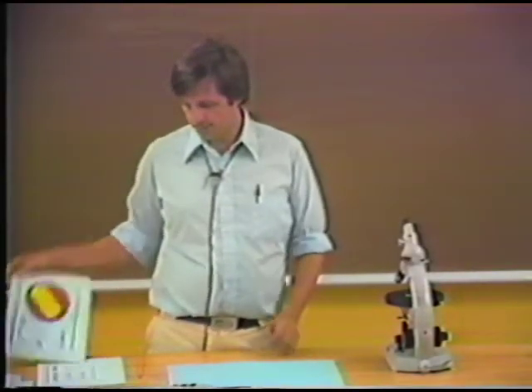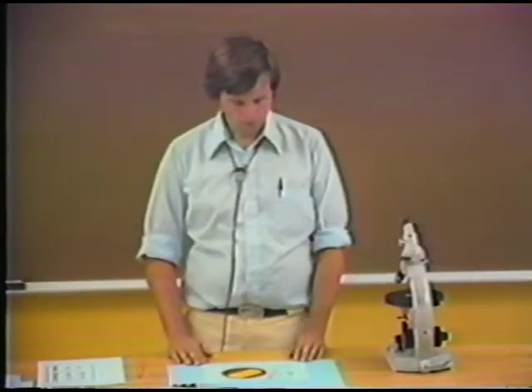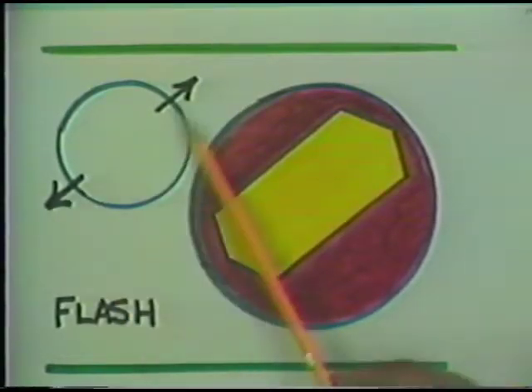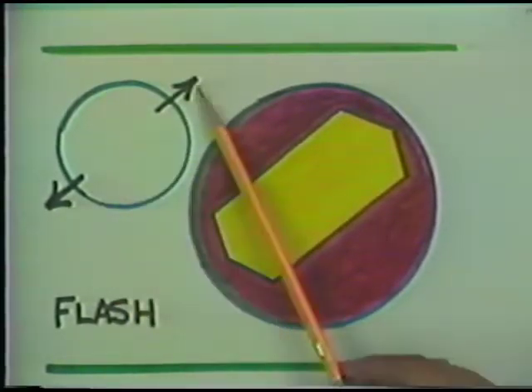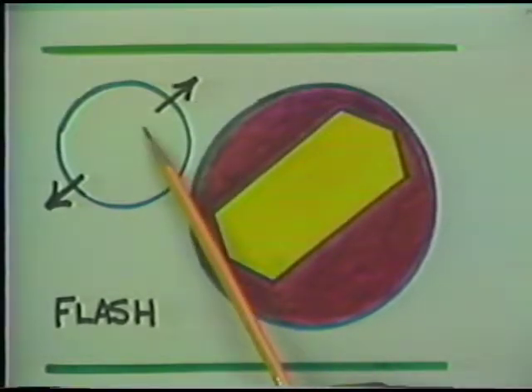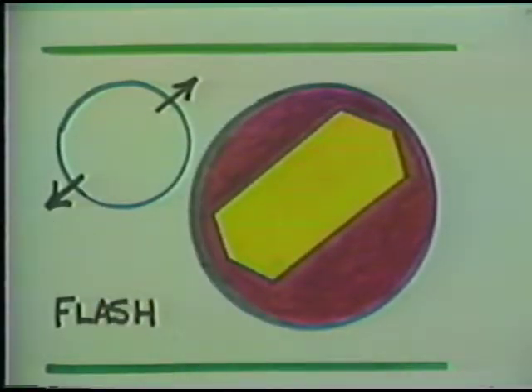Well, how about the sign determination when you're dealing with the flash figure? You can also easily get the sign relationship, and the sign is determined this way. Again, you watch the departure of the isogyres. This gives you the indication of the direction of the E ray. The isogyres always leave in the direction of the E ray.